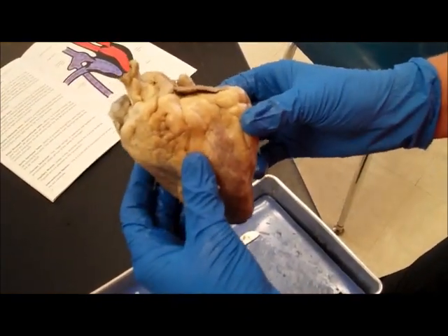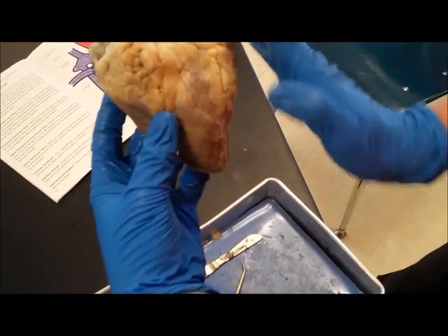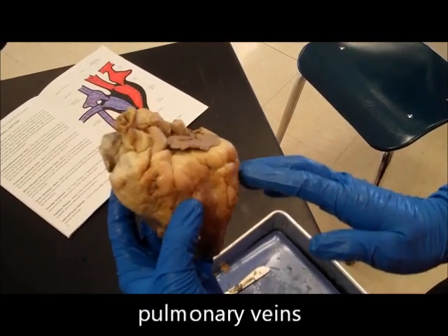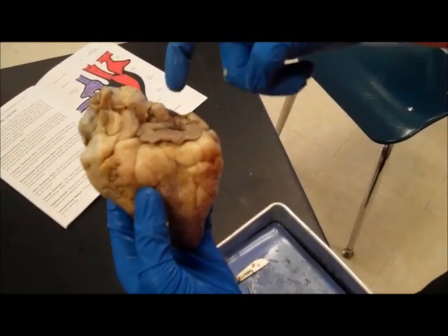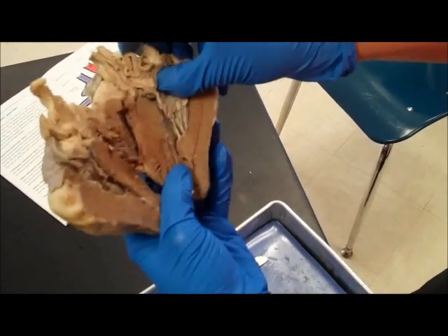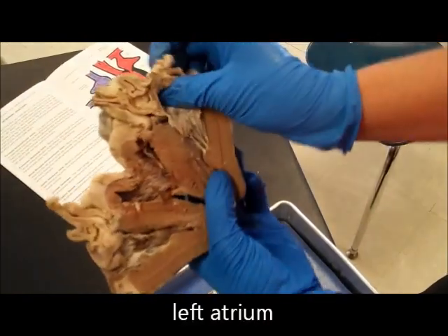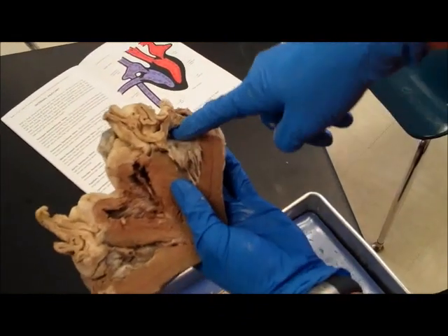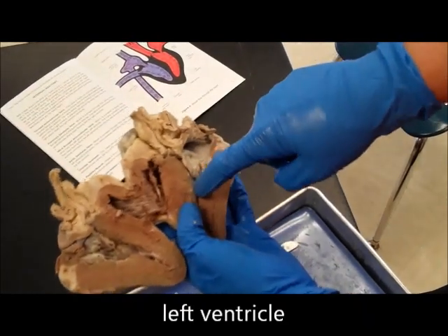As the blood gets oxygenated, it's going to come back into the heart to the left side, which, remember, is over here again. From the left side, it's going to come in through the pulmonary veins coming towards the heart. In this particular heart, the pulmonary veins have been pretty much dissected off, but I can go in. Notice I come into the left atrium up here. You can go from the inside and see it coming out. The blood then passes through the mitral or bicuspid valve into the left ventricle.